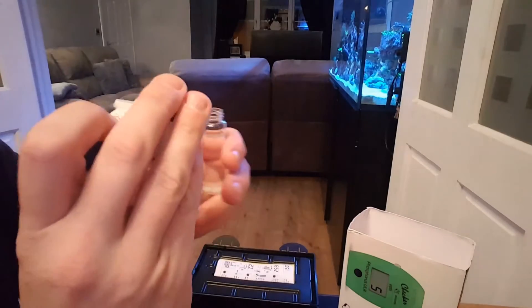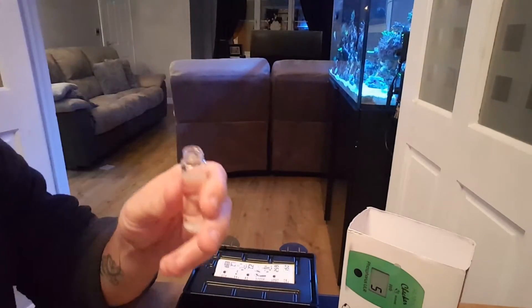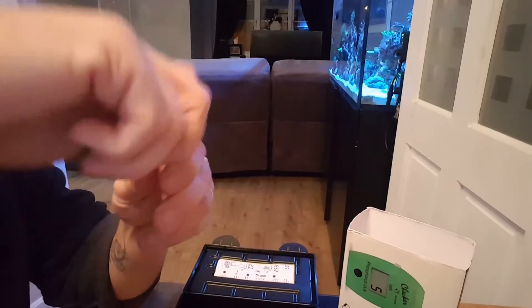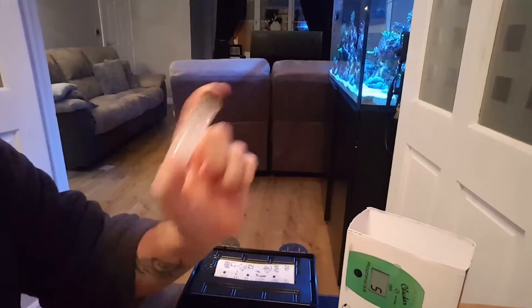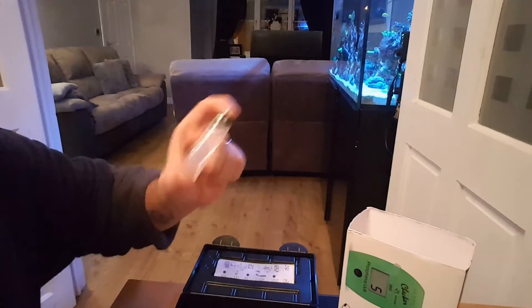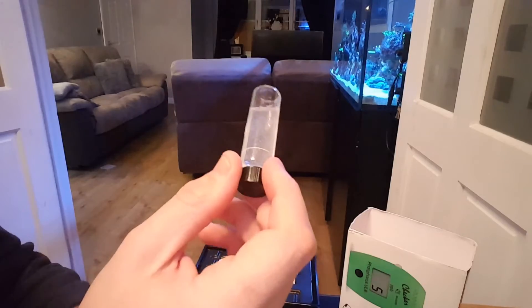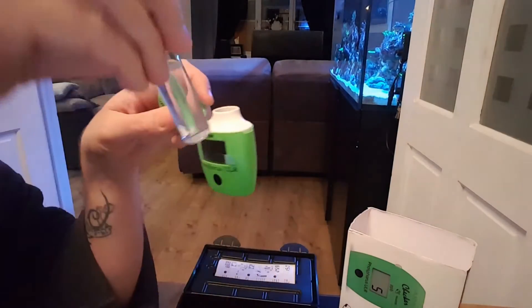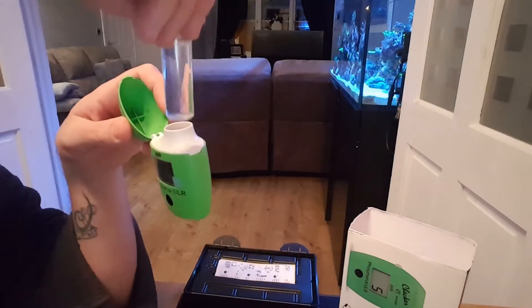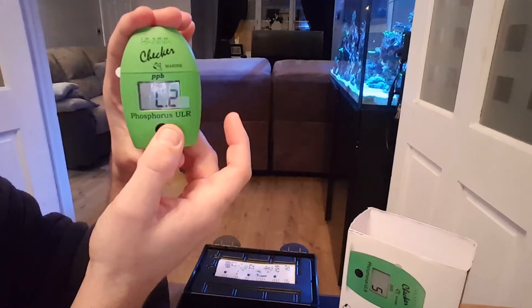They come in individual packets so you can't get the dose wrong. Now you shake vigorously for one minute. Try to get the bubbles out, then pop it into the meter.